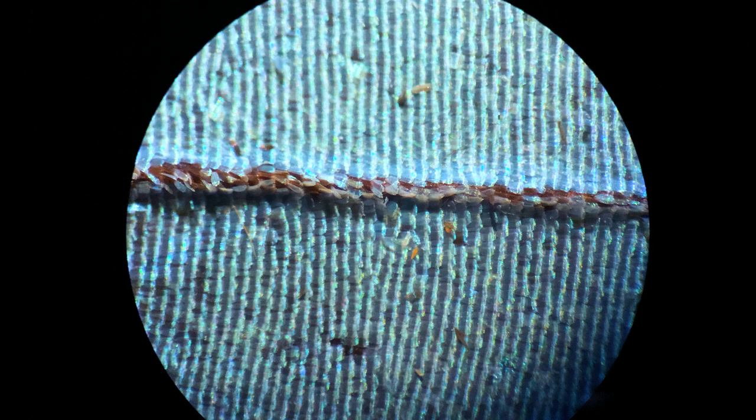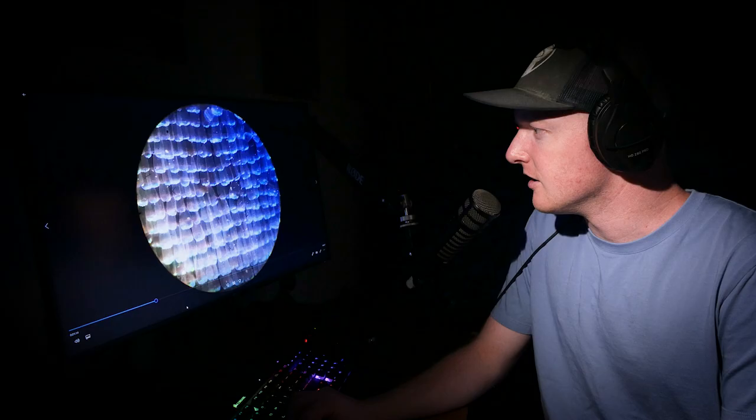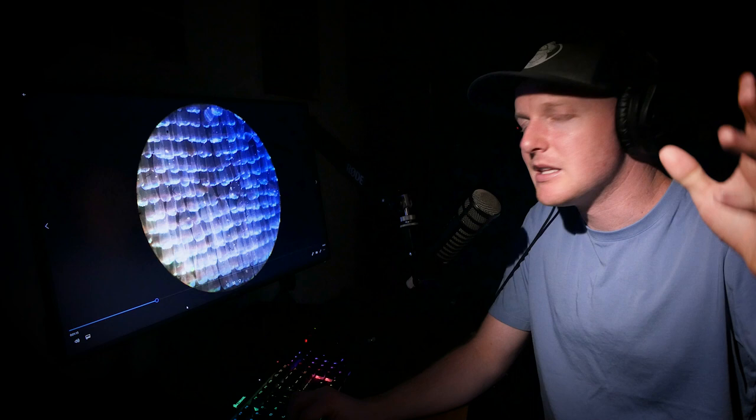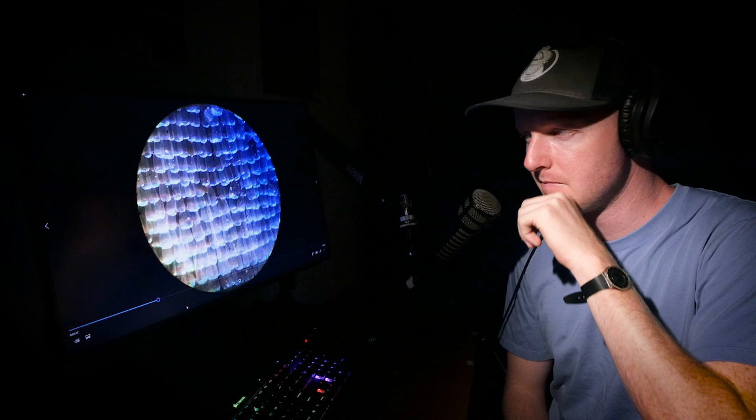Let's get up close on the compound microscope. So this is strange. This is something I didn't really expect. If you could see they seem kind of see-through. Which is very strange. I didn't really expect this. You know I expected them more to be kind of like a strong blue or something like that. Definitely not see-through like this. But it makes me wonder what the other morpho might look like. The one that's much shinier. So let's bring that one out and see what that looks like under the microscope.